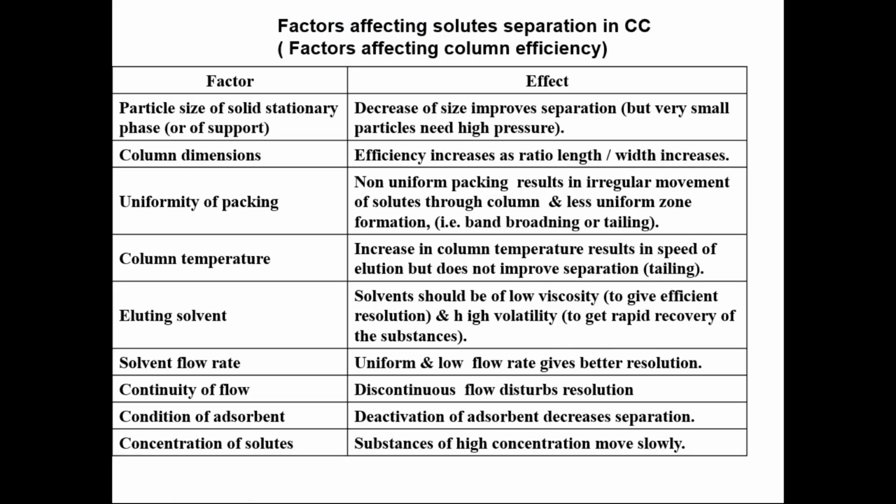So there are several factors in column chromatography which affect the efficiency of the separation, and these include particle size of the solid stationary phase, the column dimensions, the uniformity of packing, column temperature, the eluting solvent, the solvent flow rate, the continuity of flow, the condition of the adsorbent, and concentration of solutes.